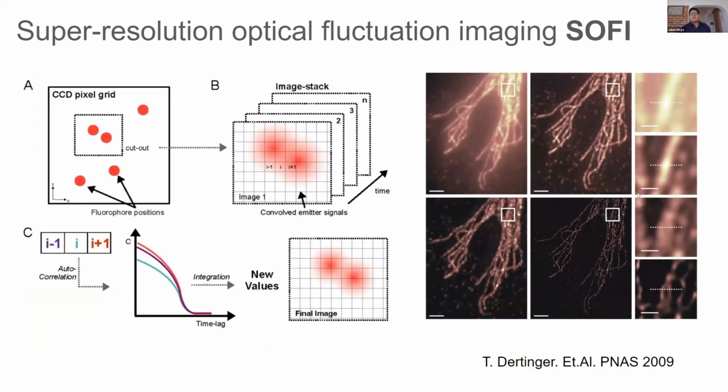Okay, now I think we are ready to jump to SOFI. As I mentioned before, this was the very first method. And what SOFI does is a higher-order statistical analysis with moments. Pretty much, it's hard to describe without the equations what these moments or cumulants are, but you take the information in each frame and you gather it together with the next frame and the next frame and the next frame, with a little bit of weight.